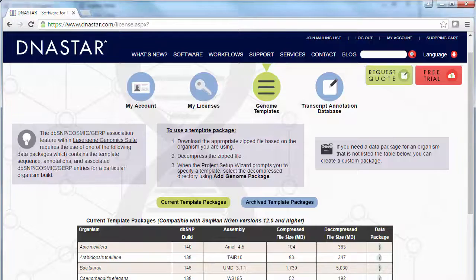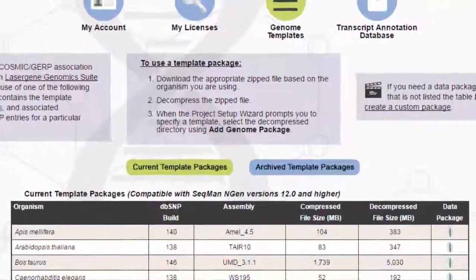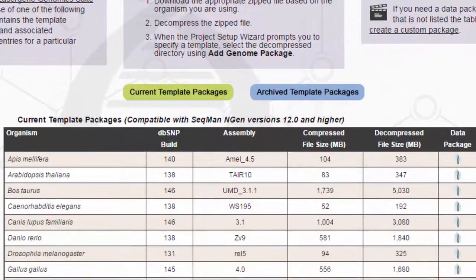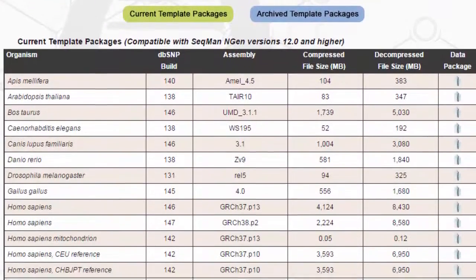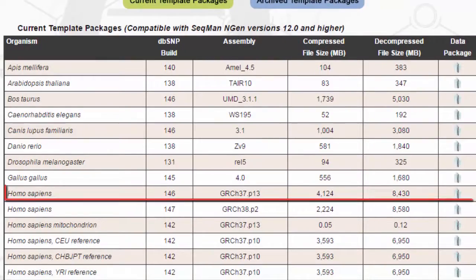In this case, I've used one of the Human Genome Template Packages that I downloaded from the DNA Star website.